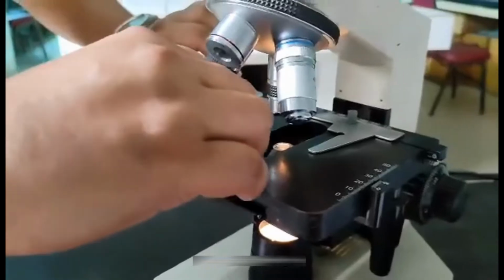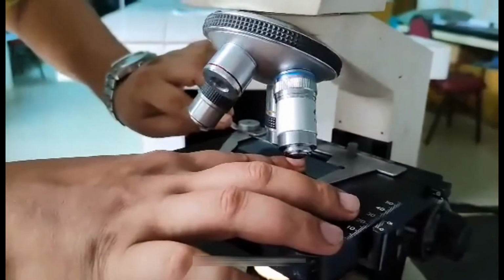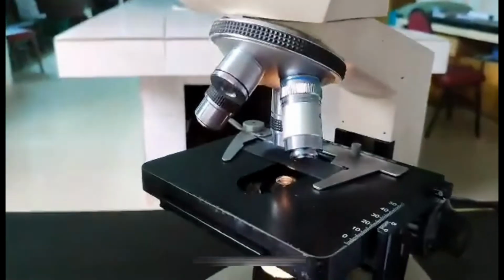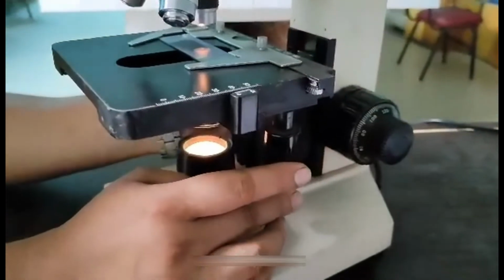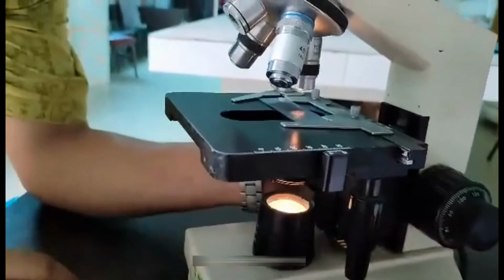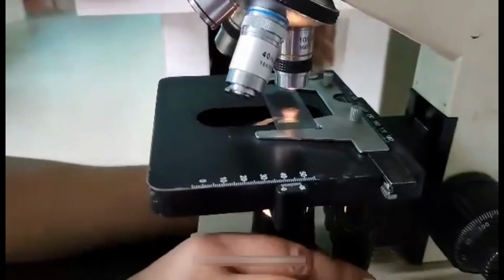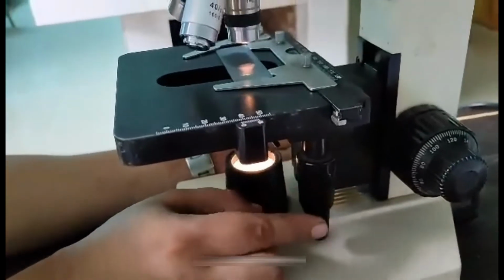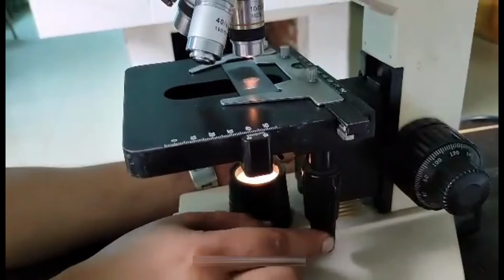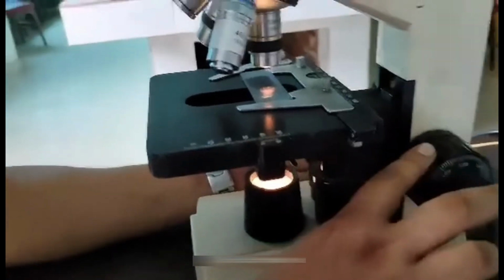Students, now I am showing how to fix a slide. First of all, you have to turn the clip, and then the stage. After placing the slide on the stage, you can use the stage controller to move it to your suitable point, and the clip controller.